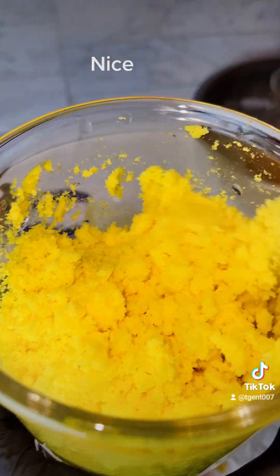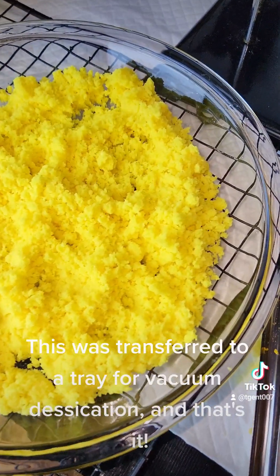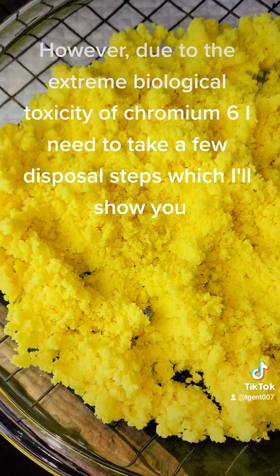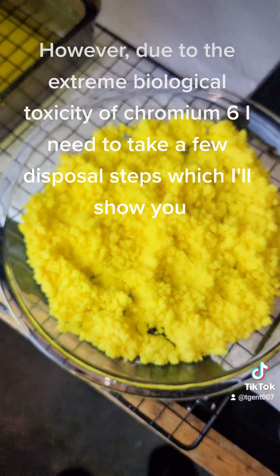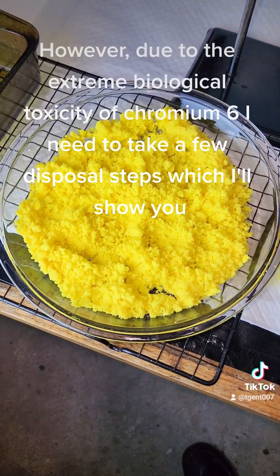This was transferred to a tray for vacuum desiccation, and that's it. However, due to the extreme biological toxicity of chromium-6, I need to take a few disposal steps, which I'll show you.